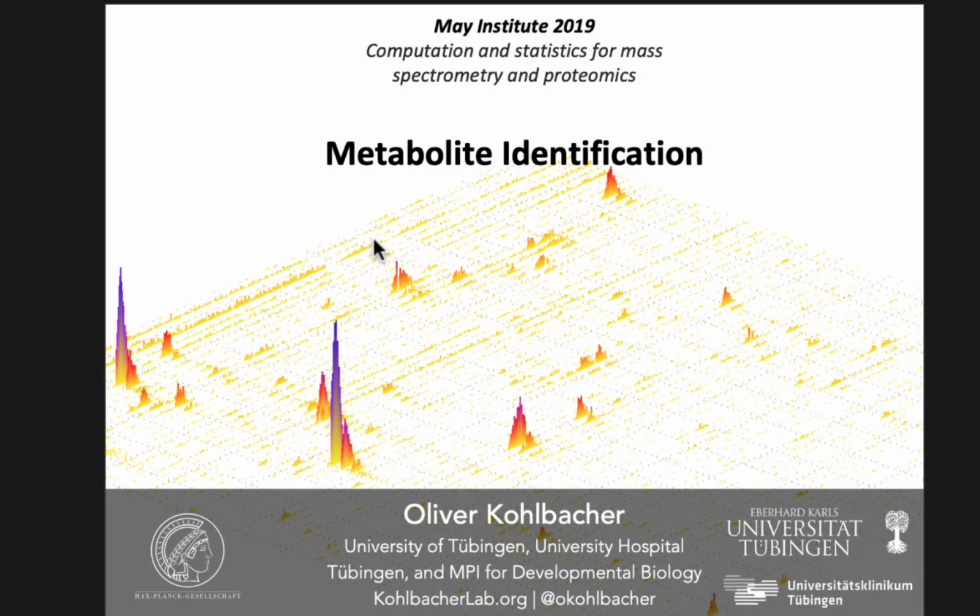So, as promised yesterday, we will talk a bit about metabolite identification. Now that I hope all of you could work your way through the tutorial on how to quantify them differentially and figure out what is going on, we will talk a bit about the identification of metabolites, which is a bit more difficult than with peptides. And that's another reason why I always tend to suggest quantify first and identify later.